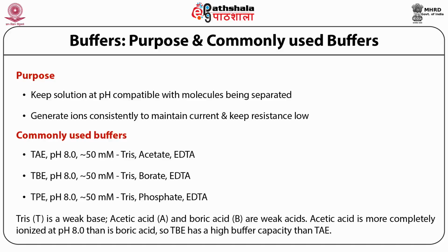And obviously, that particular buffer which has less toxicity and more solubility is preferred. High UV absorption and the possibility of interaction with other species present in the solutions are some of the other factors taken into consideration while choosing the right buffer. Some of the commonly used buffers are TAE in a concentration of 1x, TBE in a concentration of 0.5x, and TPE in a concentration of 1x.